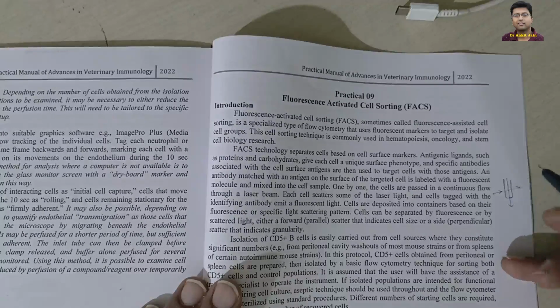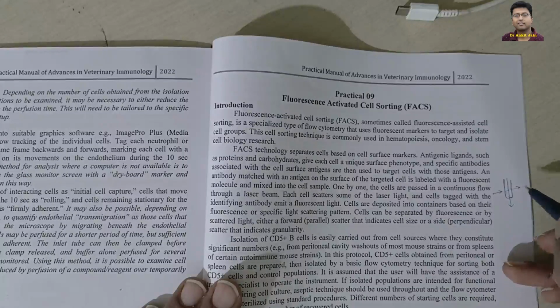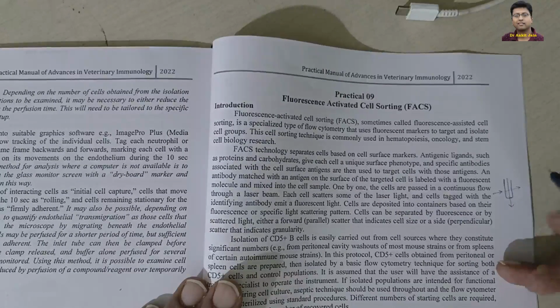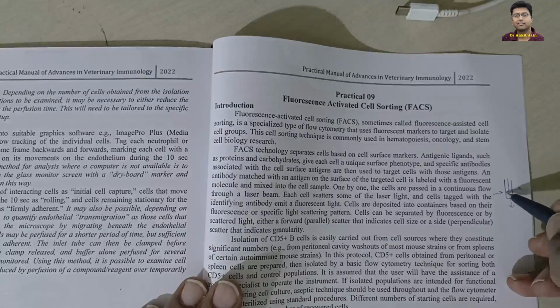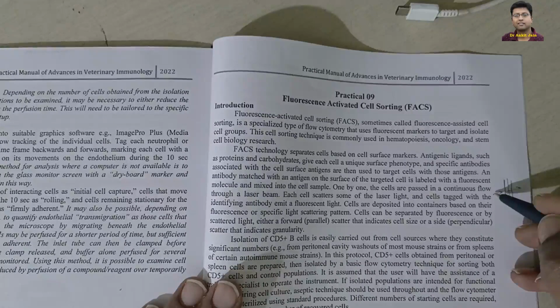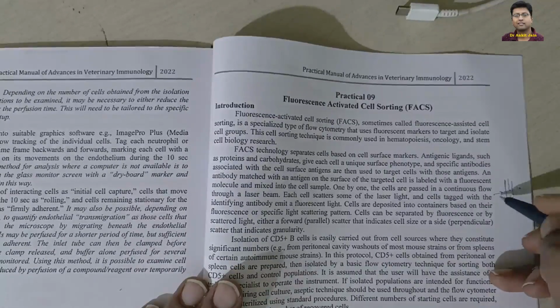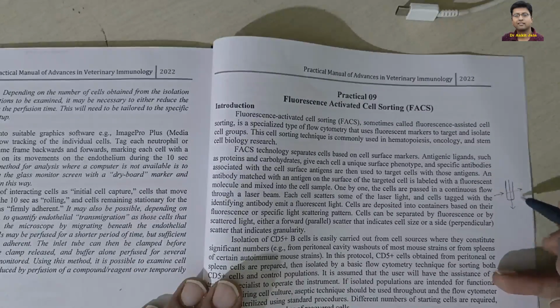So some scattering is there, and we measure the scattering as well as the fluorescence. If the laser beam passes through the cell, it has some refraction and leads to a change in the direction of the light.